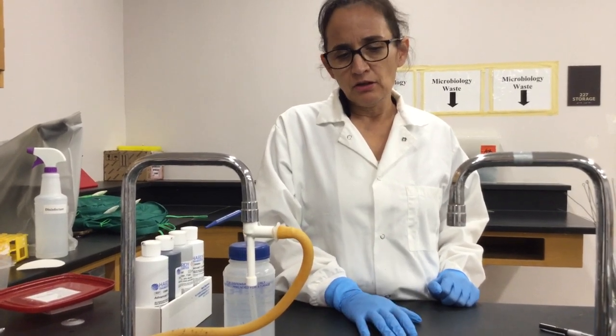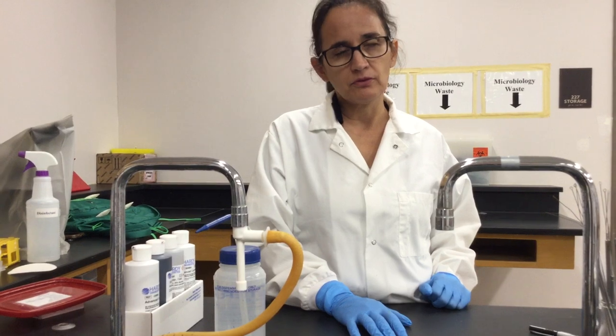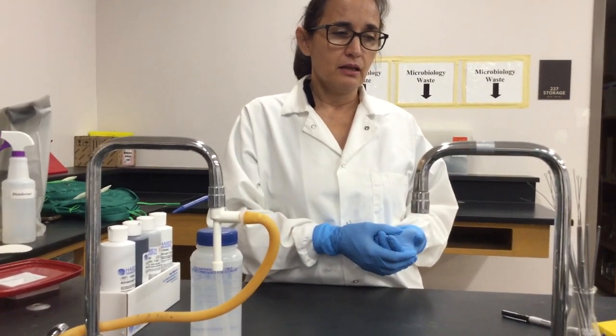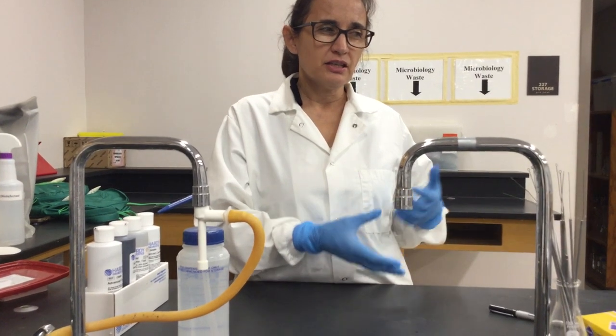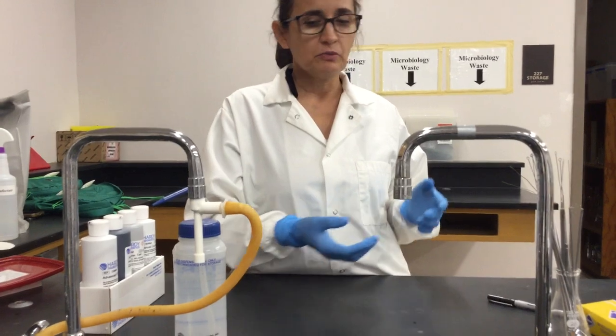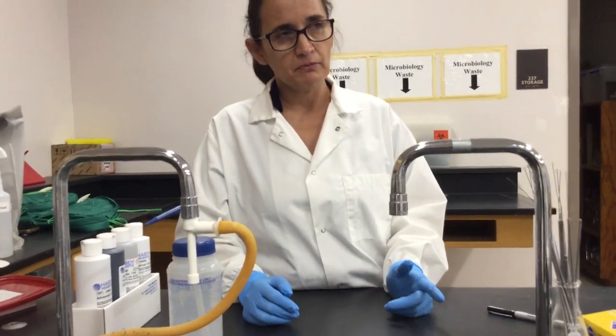Now in terms of volume, of course, bacilli have more volume than a sphere. And that can give you a clue whether the bacteria can produce endospores or not. Endospores, remember, are the dormant form of bacteria.